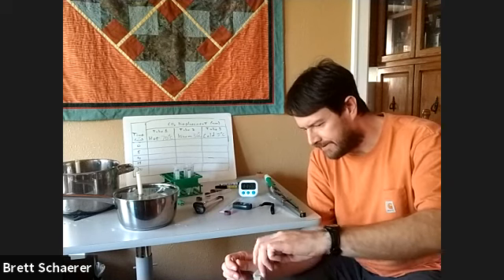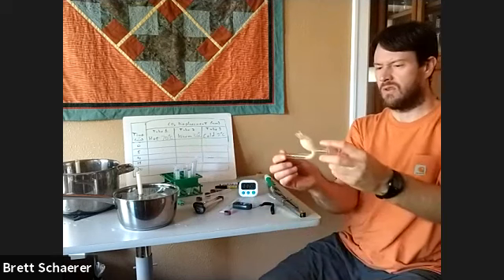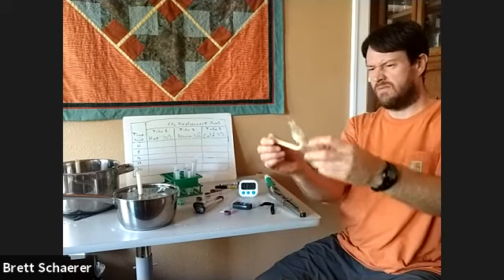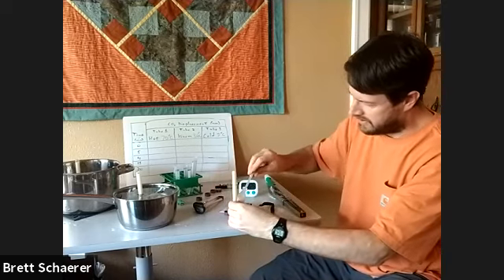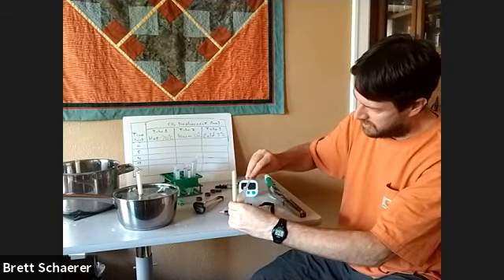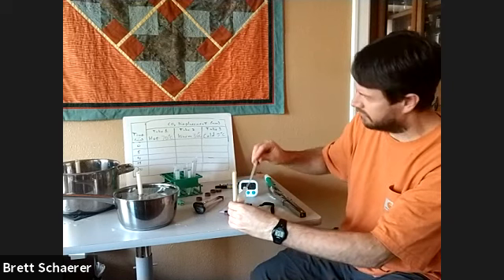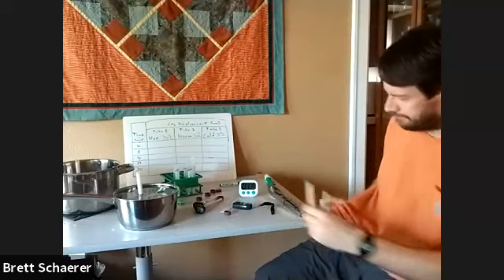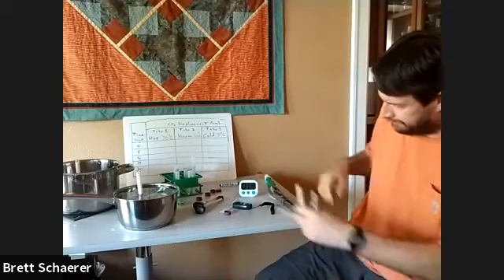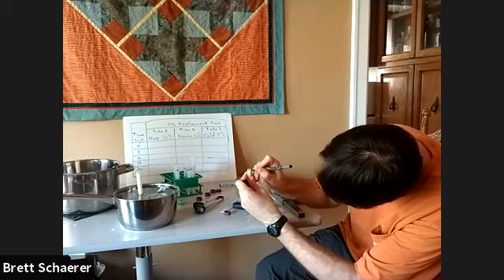Okay. In at our air bubble. And make a mark. There we go.